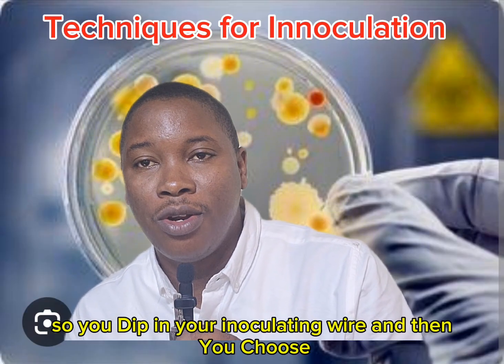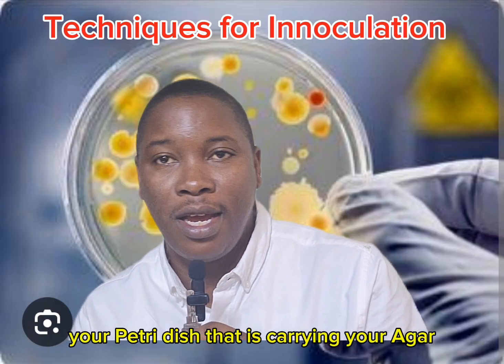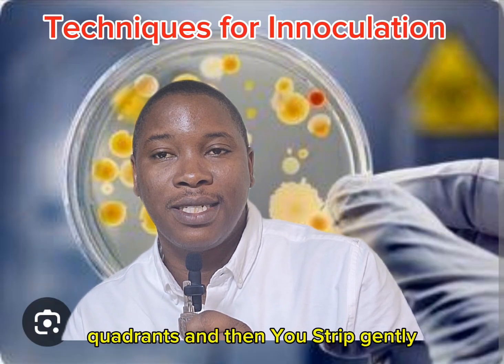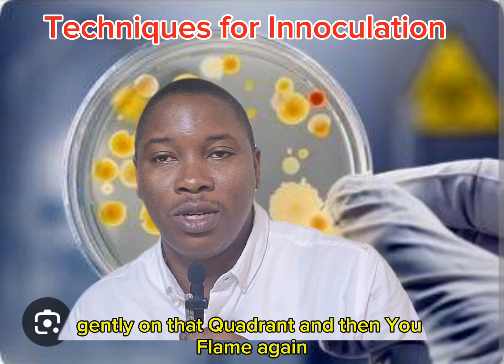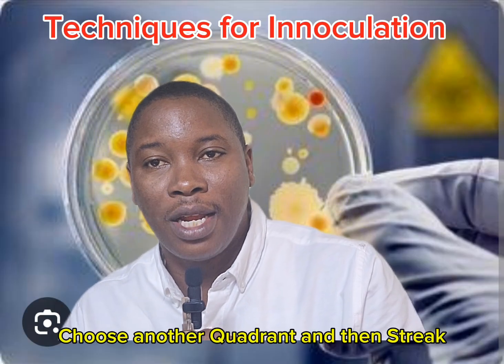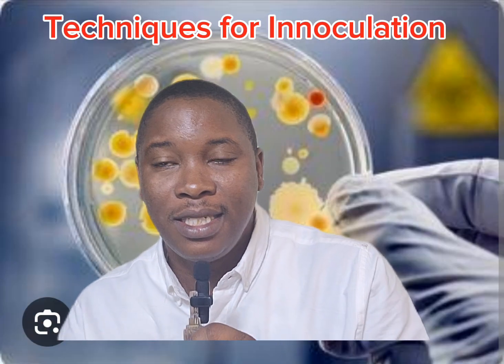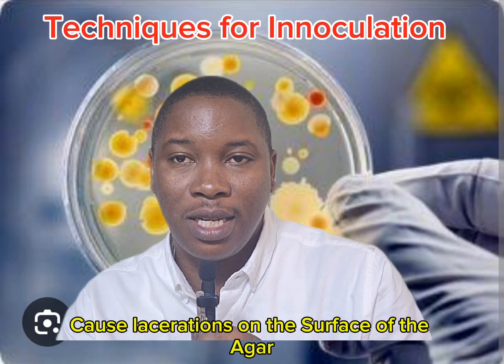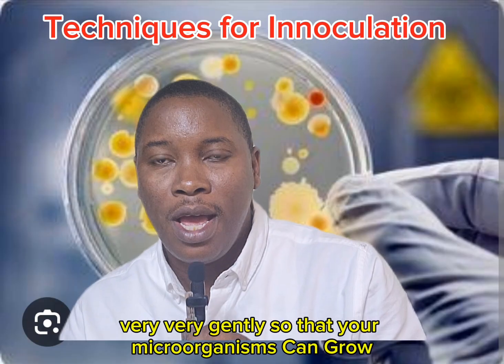So you dip in your inoculating wire, and then you look at your petri dish that is carrying your agar. You mentally divide it into four quadrants. You pick one of the quadrants, and then you streak gently with a back and forth movement on that quadrant, and then you flame again. When you flame again, you dip inside your sample, choose another quadrant, and then streak. You have this zigzag motion that is done gently, in such a way as not to cause lacerations on the surface of the agar. Rather, very very gently, so that your microorganisms can grow. And that is the streaking method.